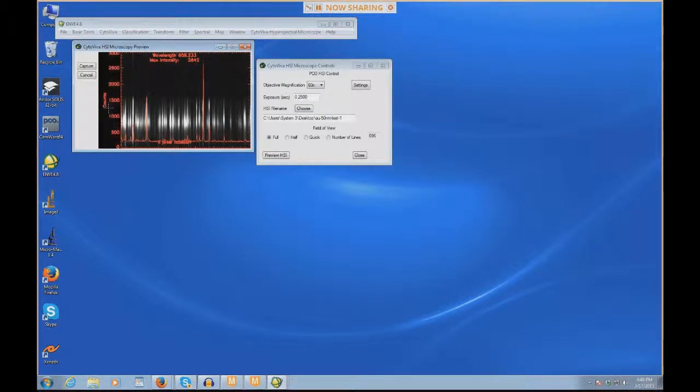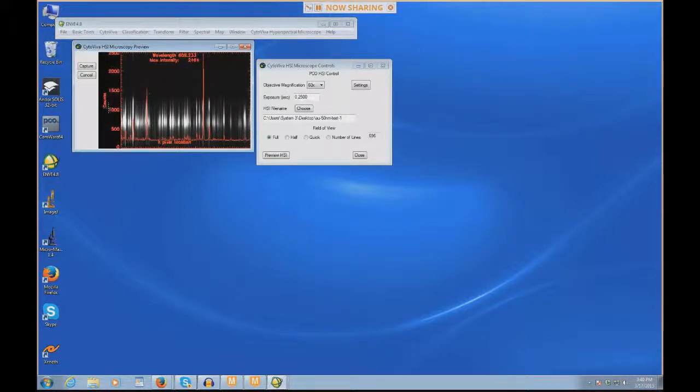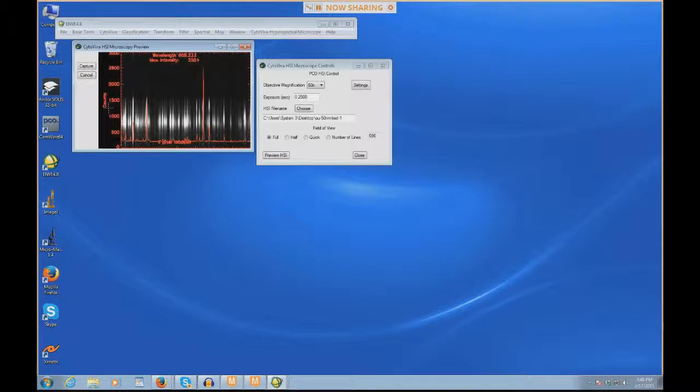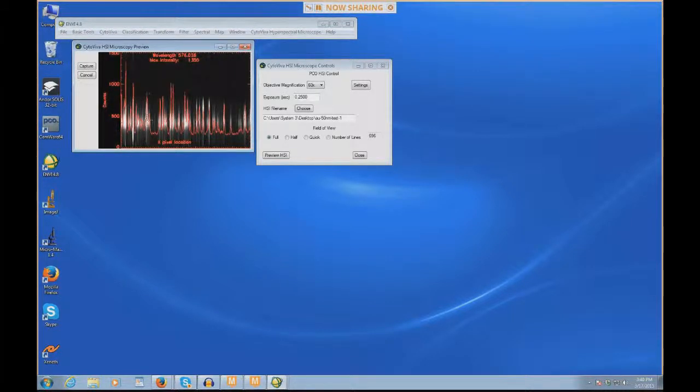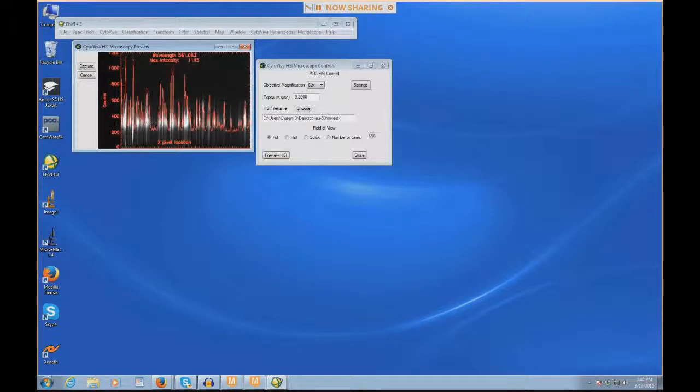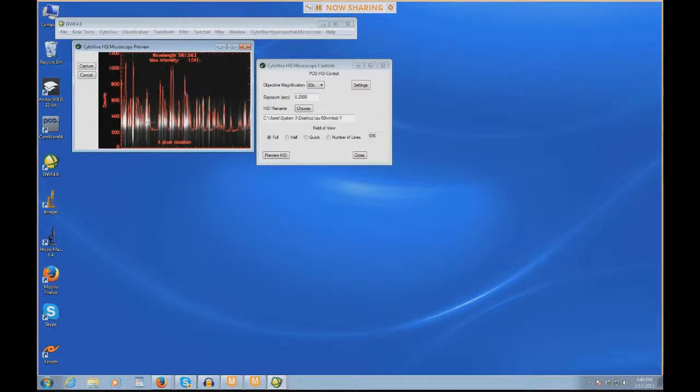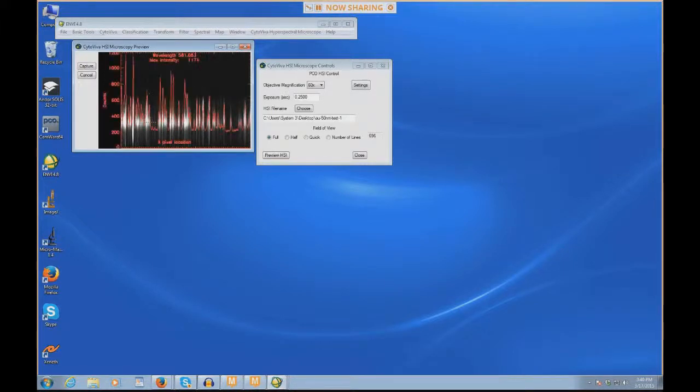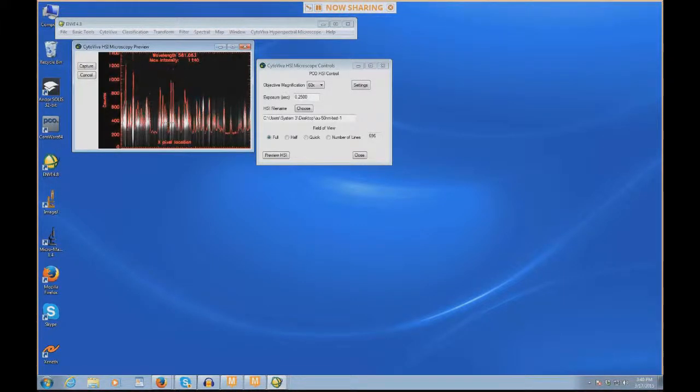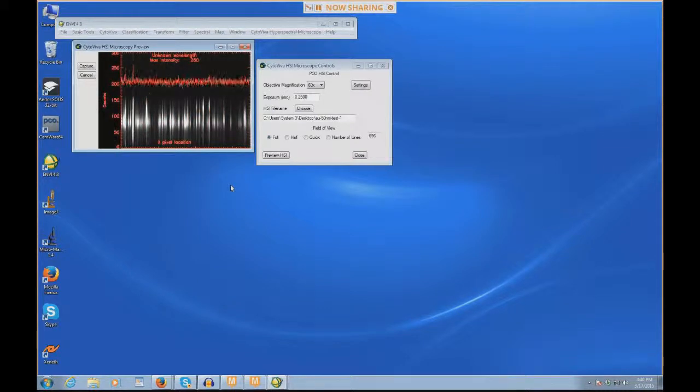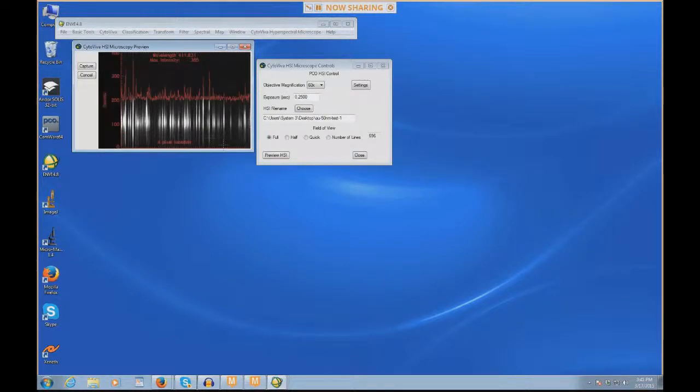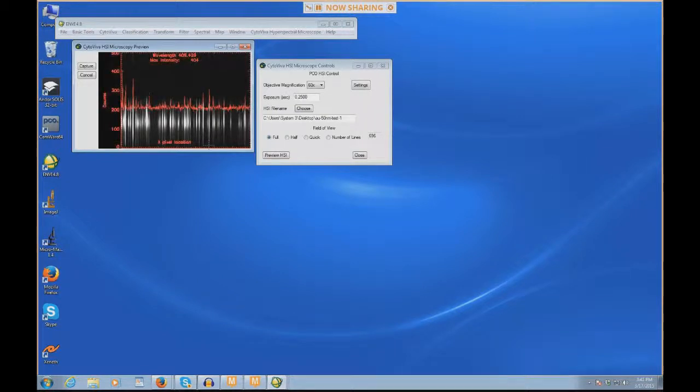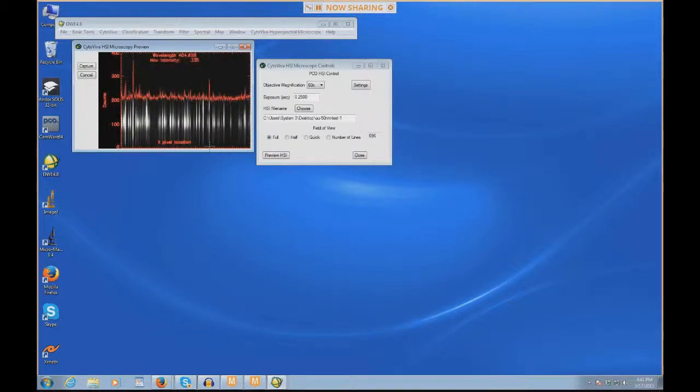Over here on the left, these counts represent the dynamic range of the camera. This is a 14-bit camera, meaning the dynamic range of this camera has numbers that go from 0 to about 15,000. This is showing you the intensity of these particles in the X location. Here, we see these particles, and they're represented as these sort of wisps, these thin lines of light. If I put the cursor at the bottom of the preview window, you'll notice it says wavelength 404.